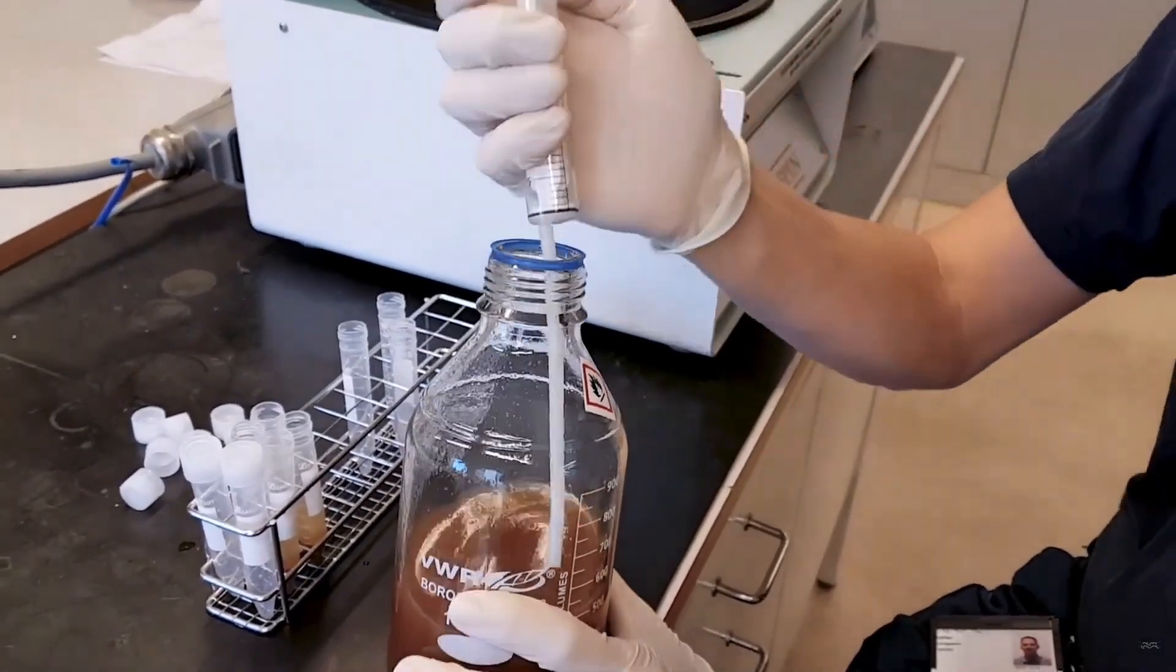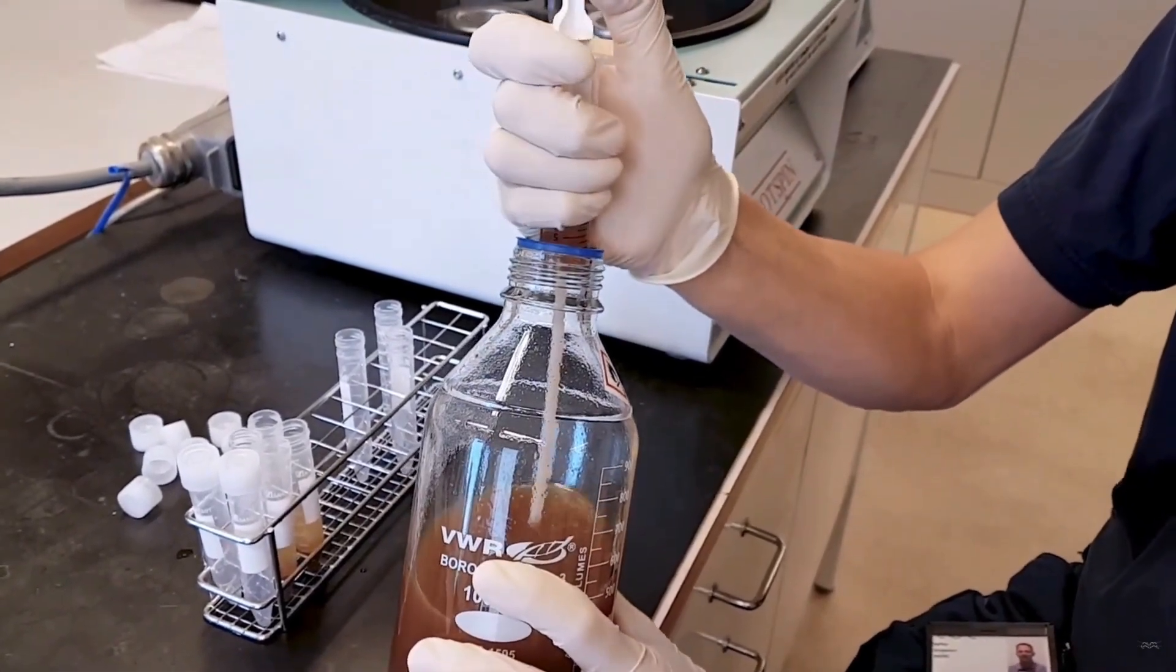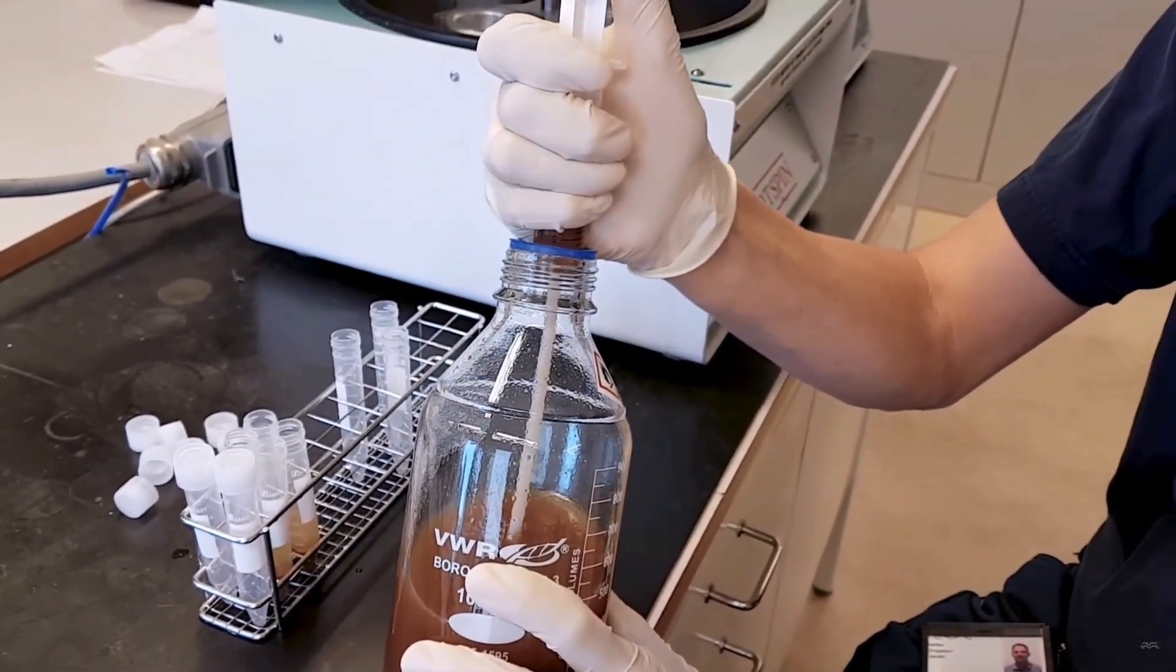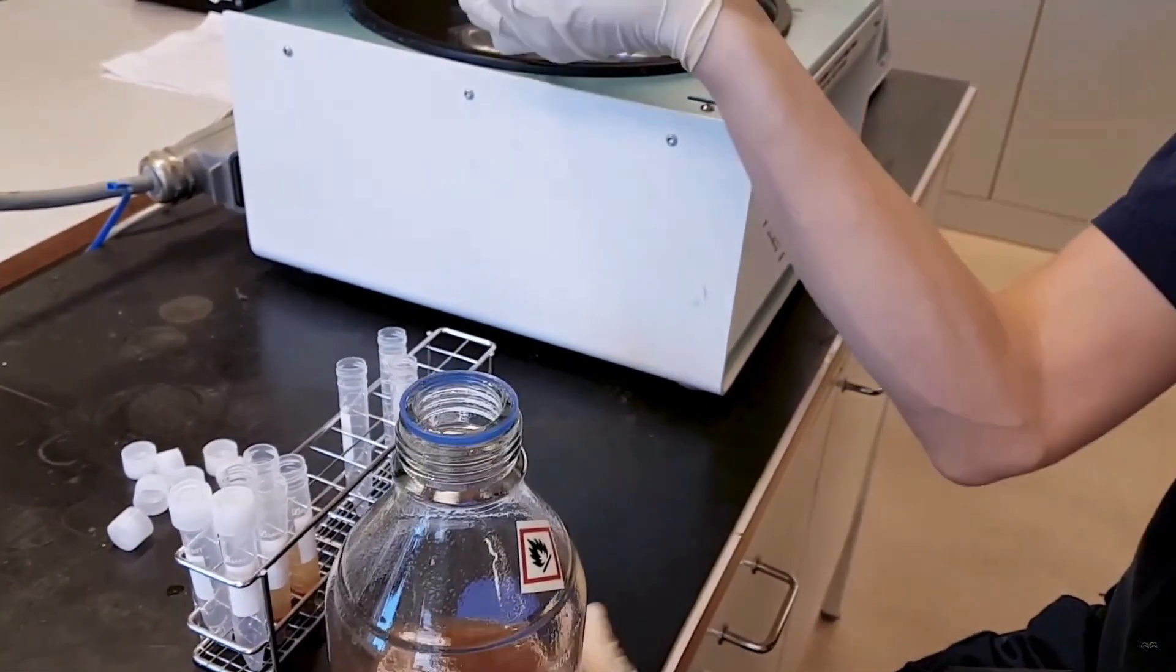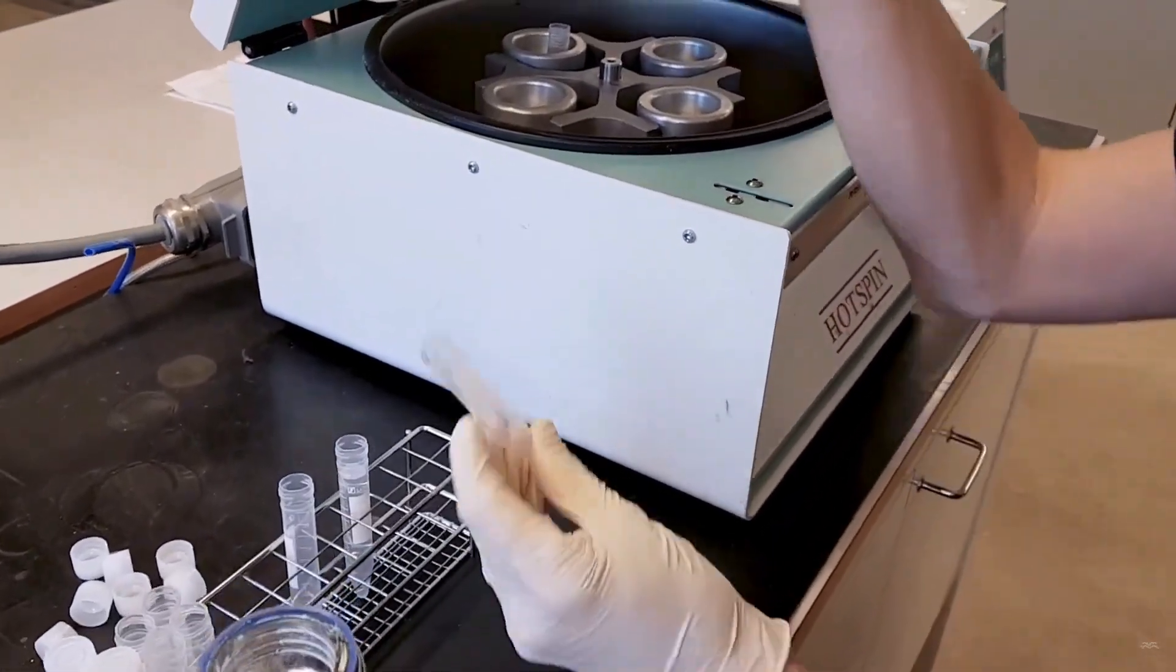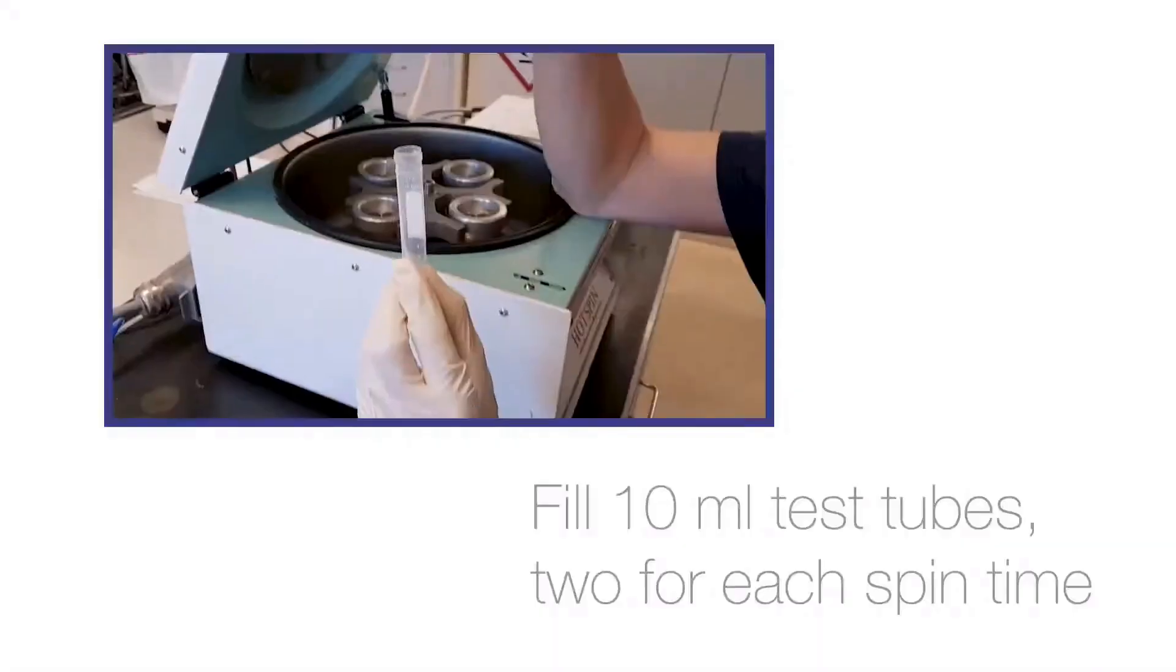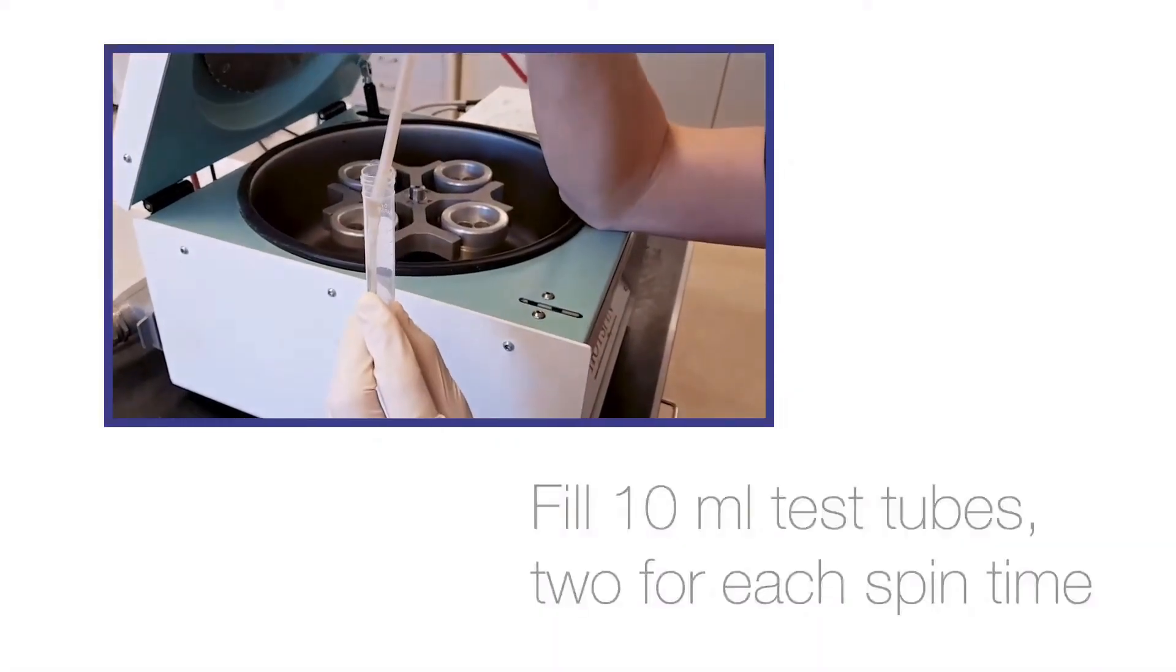After that you then need to sample 10 milliliters with a syringe and add them to a vial. As you need two vials for each testing time you will need to repeat the sampling twice.